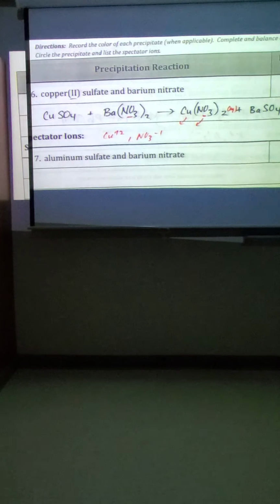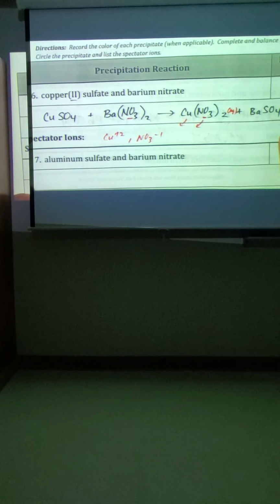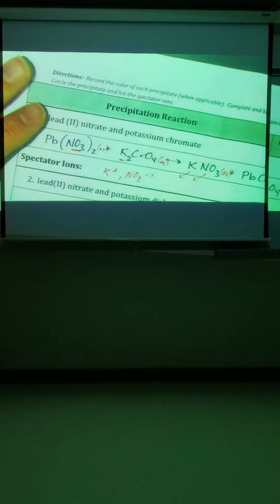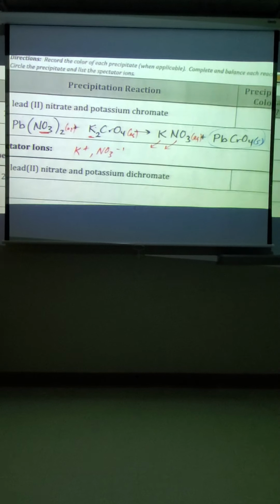And if we go back to our example, there's one of those crazy ex-boyfriends or girlfriends that we're worried about. There's our solid. And if we see that color, and we will, these are the ones that we'd circle. I'm not sure if we circled that one on the other page, but again, precipitates are circled in the end. So again, that one there would have gotten circled. I just skipped that step.